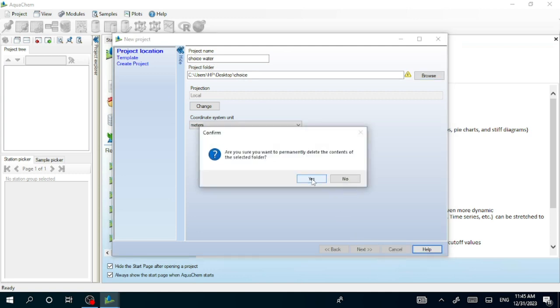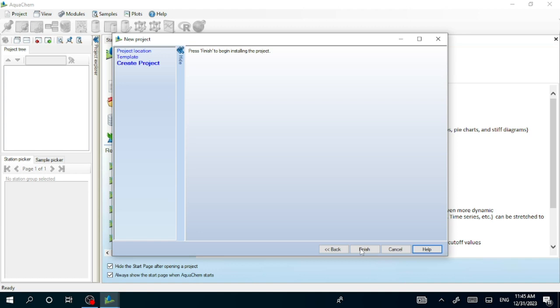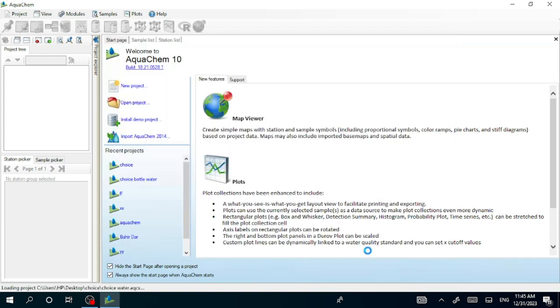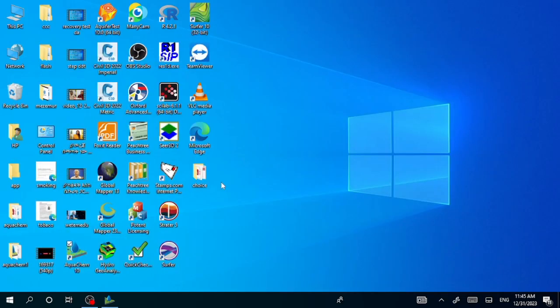Now go to Next. It asks if you want to permanently delete the contents of the selected folder — nothing is available, it's empty, so continue and then Finish. It's a very easy step to create the project. After that, when you see the recent projects, 'Choice Water' is my new project.